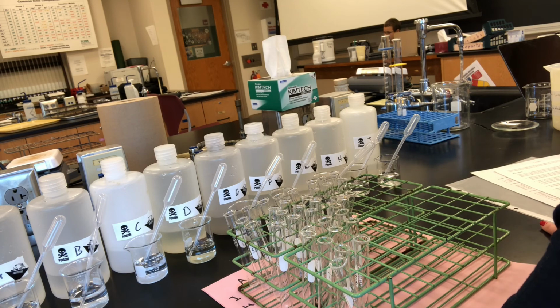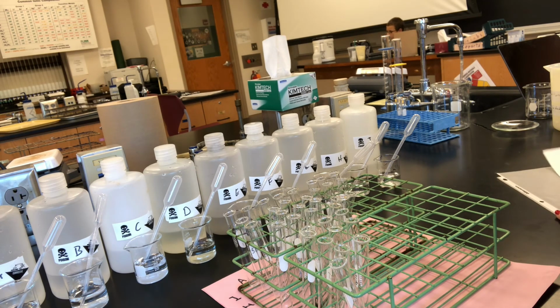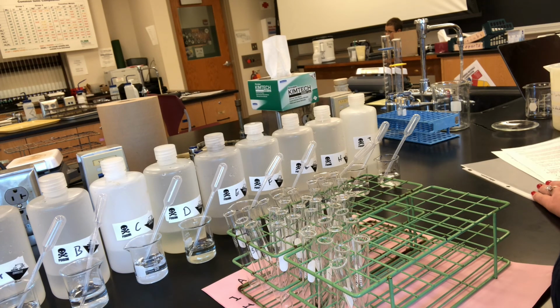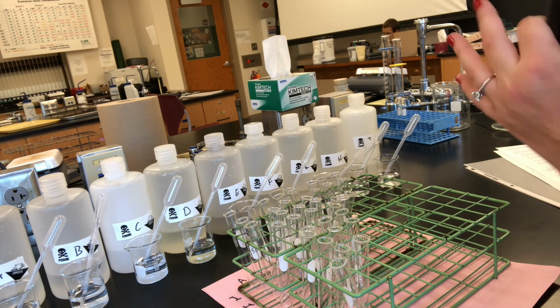So this is a solubility lab, and being successful in identifying everything properly in this lab hinges on you having completed your pre-lab properly. In your pre-lab, you were given basically what we're doing and identifying which sets of solutions would form a precipitate.